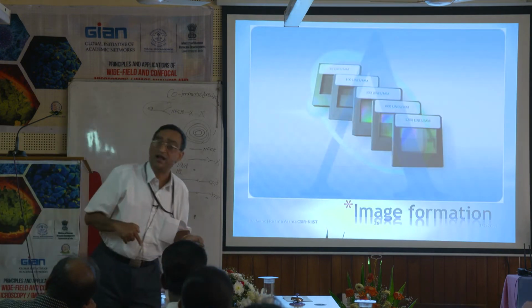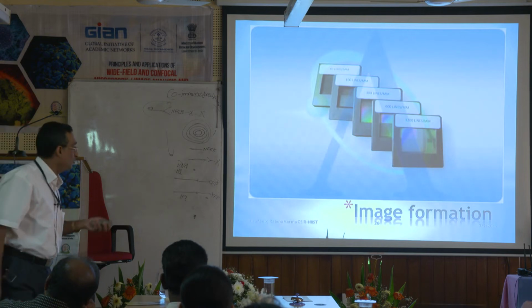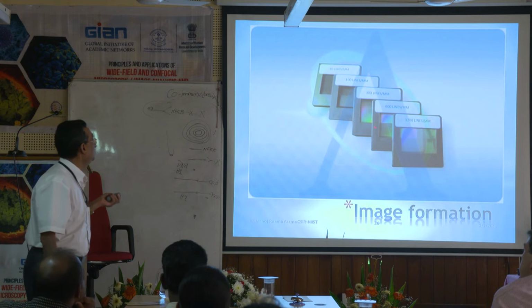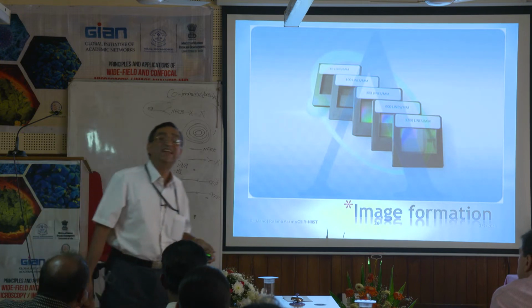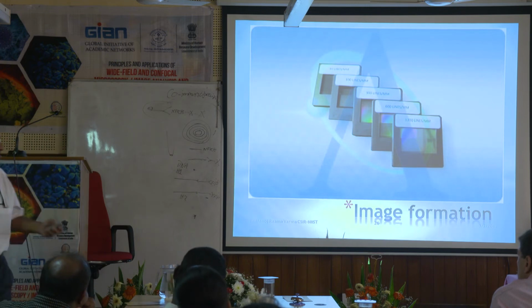And why we have done all these things, there is a reason. For example, I will tell. Now, look, here I have shown a series of diffraction gratings. You would have done them in physics practical classes. Diffraction grating, what is this?